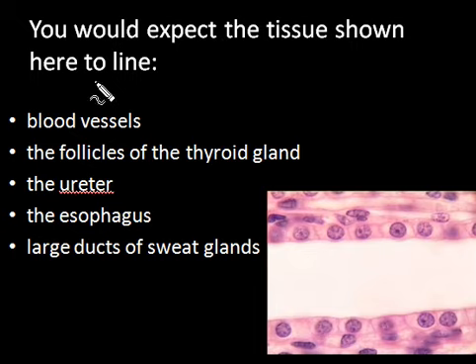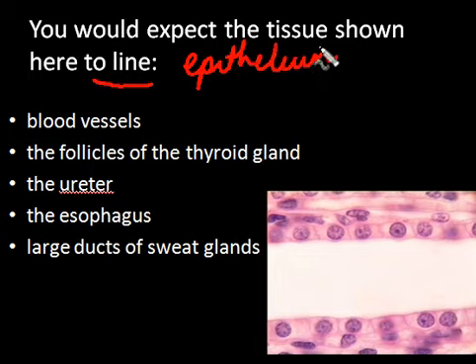Now here the key word is to line. When you see this kind of a word, it means that it has to be epithelium, because epithelium is the only tissue which lines cavities, the inside of an organ or on the external surface, for example, skin.